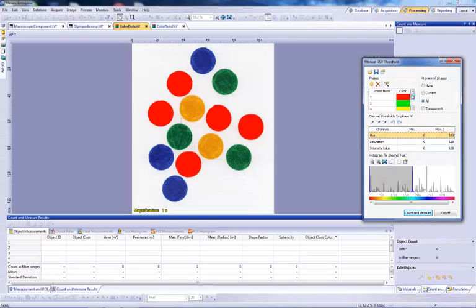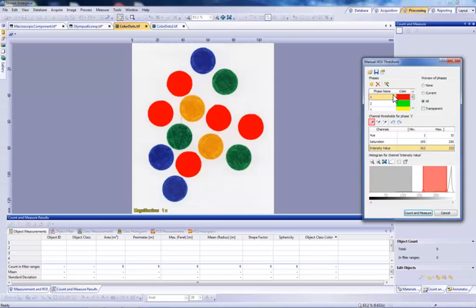We can see by scrolling through the list we have four phases and each match to a color in our sample image. The color matching is a coincidence, and each color can be changed in the list. The color will match to the overlying threshold. To begin, we will select the first phase, and since its color is red, we will use this phase for our red range.